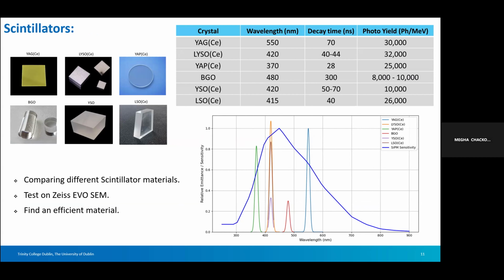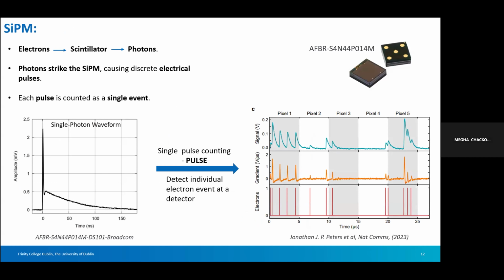YAG is the scintillator currently used in TEM studies. I have also considered other scintillators like LYSO, YAP, BGO, YSO, and LSO. Why? Because of the wavelength, decay time, and photon yield. These three parameters are the most important things I should consider to make sure these scintillators are best for higher speed, higher signal-to-noise ratio, and a higher number of detected electrons or photons.